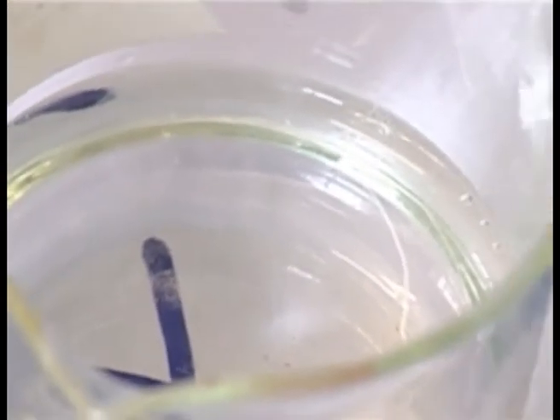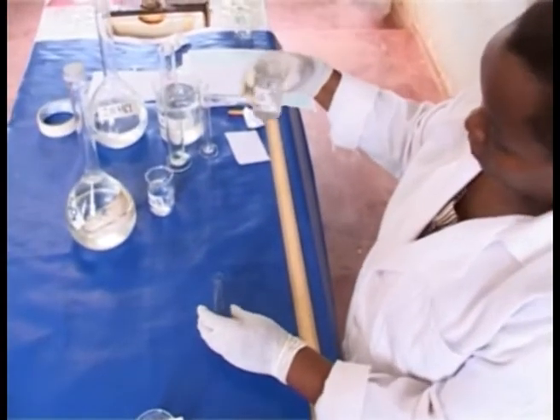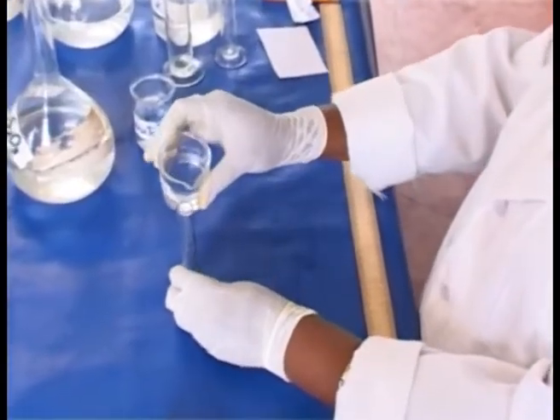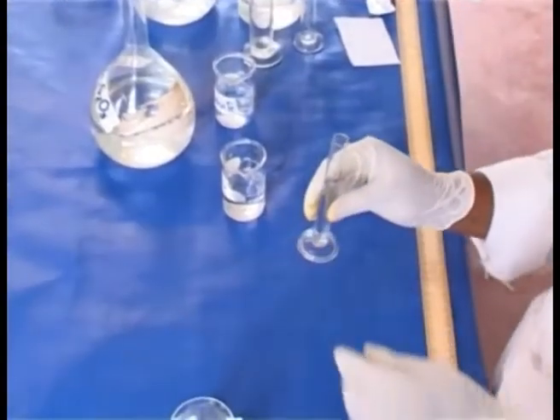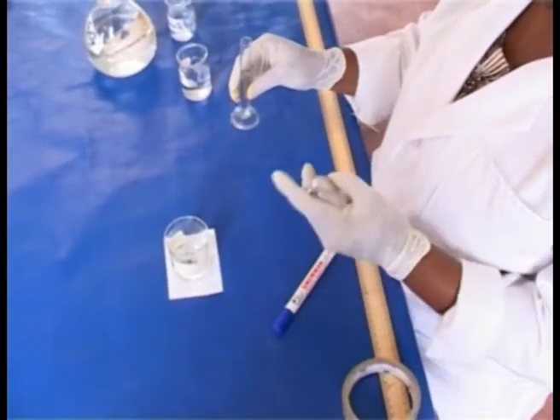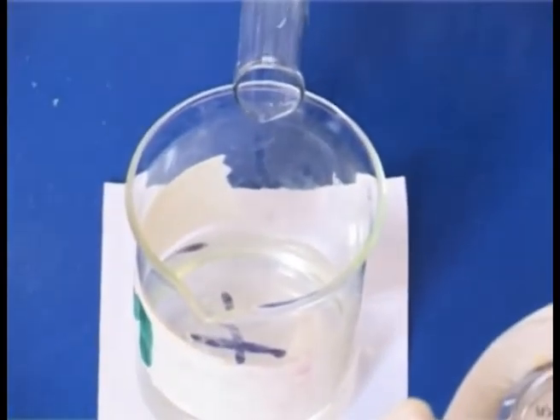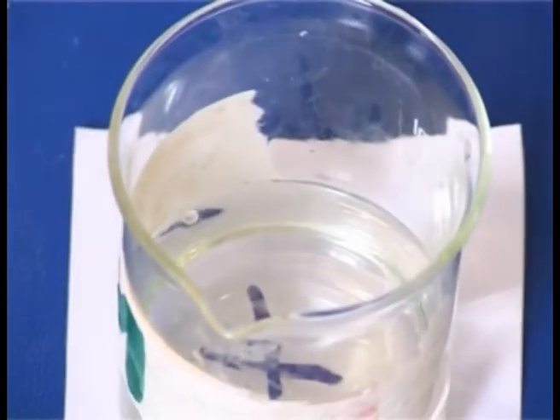Then take hydrochloric acid and measure 10 ml of hydrochloric acid. Add 10 ml of hydrochloric acid into beaker M and immediately start the stopwatch.